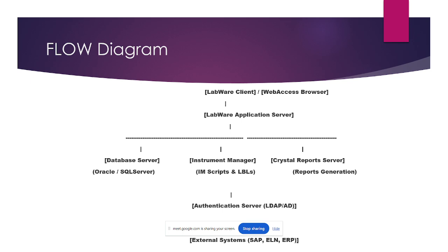Once the application is installed, we need to do the verification, that is the testing side. I will explain that later once the configurations are done. Then once the application is built up, we need to create the database server, instrument manager, and Crystal Reports server. These servers we also need to create separately.